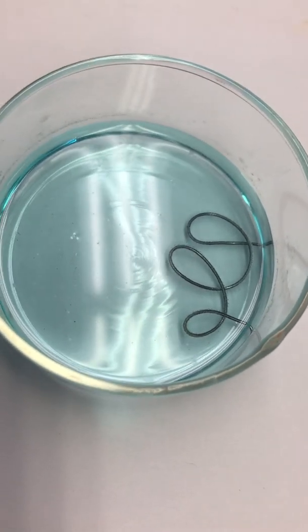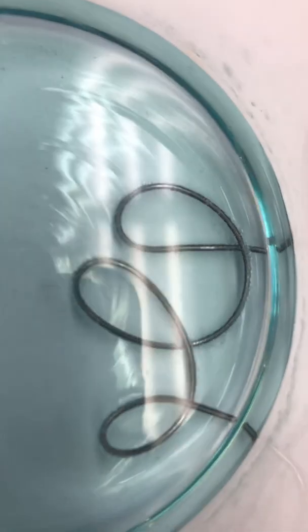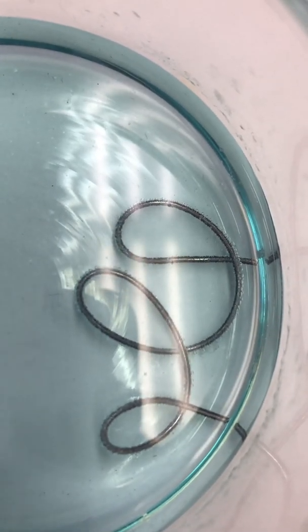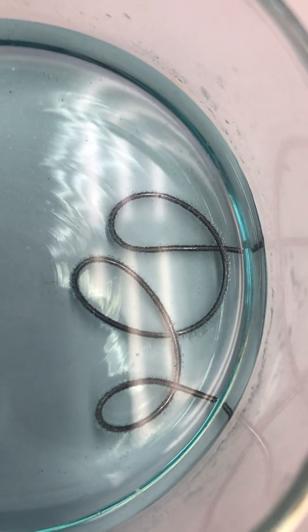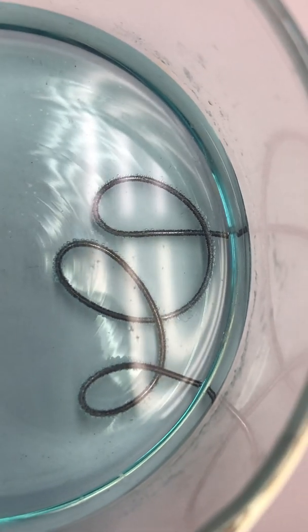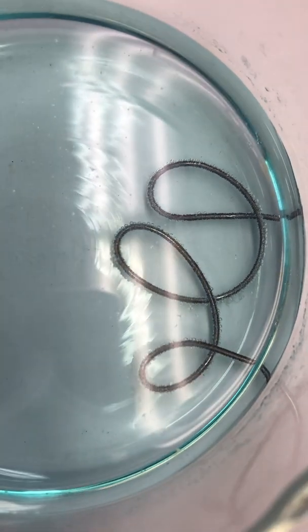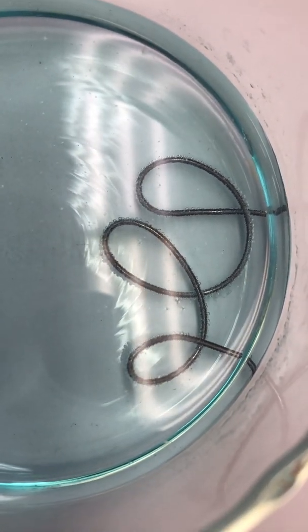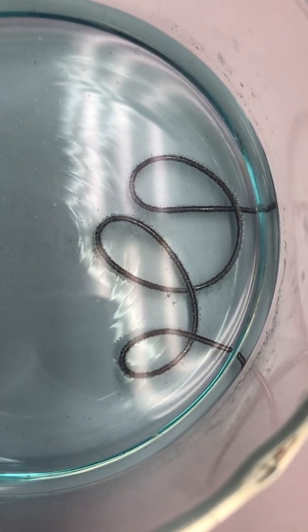Okay. And then if you look closely, occasionally you're going to see the development of tiny bubbles. And again, you've been in my class long enough to know that bubbles tell us that a gas is being formed. Okay. And you're also starting to see, and I'll take this out in a second so we can look at it, that the aluminum wire itself, you can see some color change.